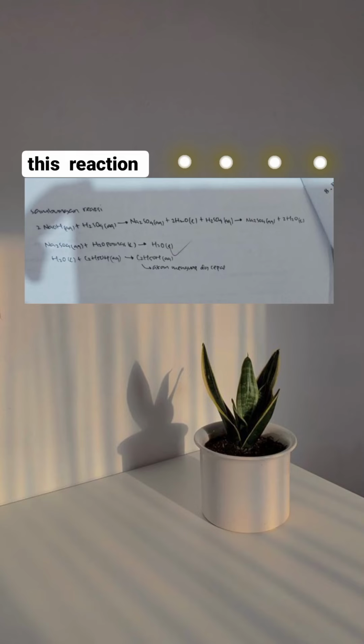When filtered, it is brown, and when washed with hot sulfuric acid, hot water, and ethanol, it is pale yellow. The color of the residue on the white filter paper is slightly yellow. Here is the reaction I show in the picture. And here I show the result of calculation that I got.